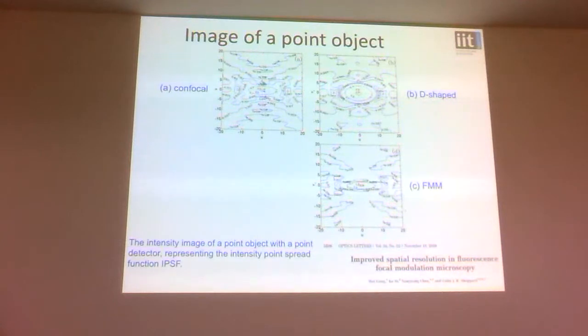Yeah, but we're not, because we're putting two beams down, so we are effectively using all the aperture. So I think the answer, I think time, speed is probably the main thing. But actually we can do this quite quickly. This beat frequency, typically, can be in the megahertz, so it's not much of a problem from the time point of view either. So I don't think you lose a lot, actually.